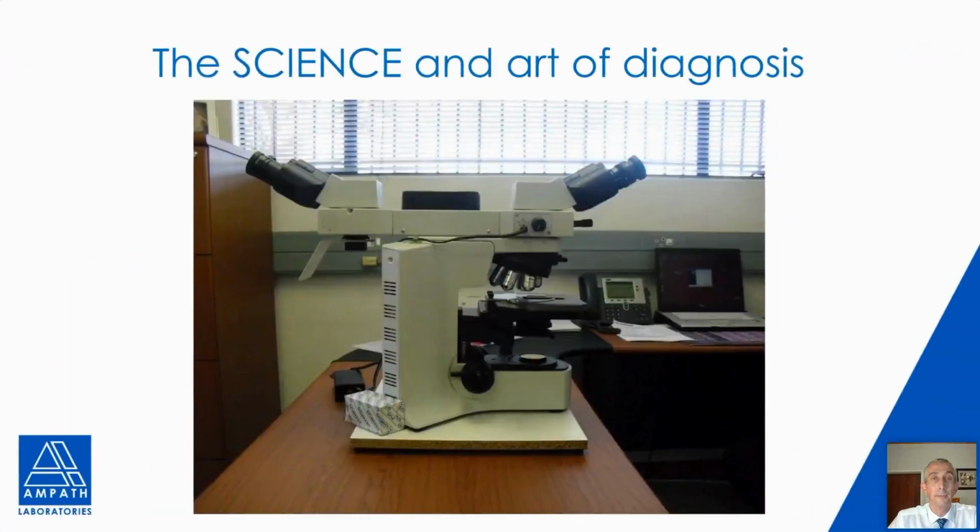The tool of the trade is the light microscope. This particular one is a double header where two pathologists can view the same slide at the same time, and this is very helpful in difficult cases.